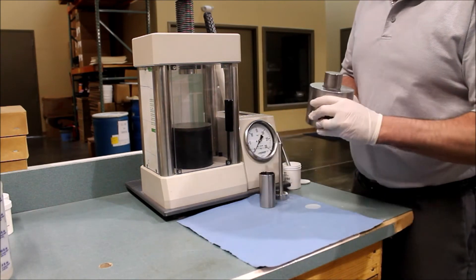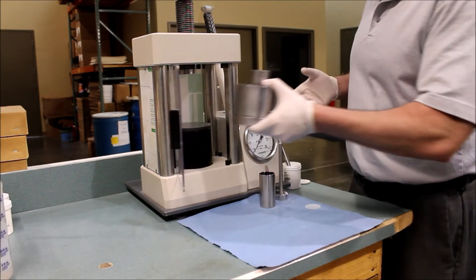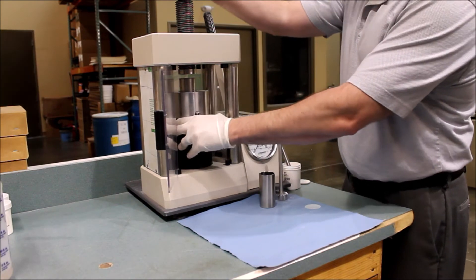Now place the assembled die set into the press and press until the tonnage is achieved, in this case 25 tons.